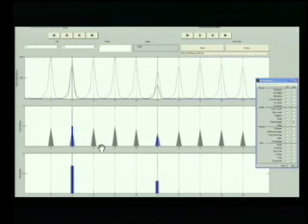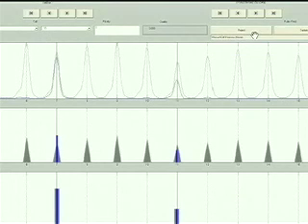One last thing I'd like to point out are the scrollbar arrows. In this region here, there are arrows that you can scroll from sample to sample, or you can scroll from priority to priority. And with TrueAllele System 2, you can define this such that you skip from one sample to the next sample of low quality value to the next sample of low quality value. Once you have reached a sample that gives you a high quality value that meets your minimum requirement for quality values, then you would push on another arrow bar to take you to the next locus.